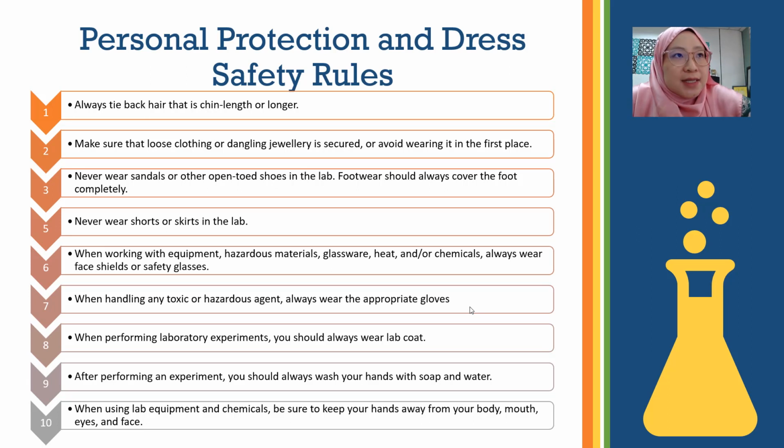Never wear sandals. You always need to wear shoes that cover your feet. Never wear shorts and skirts.